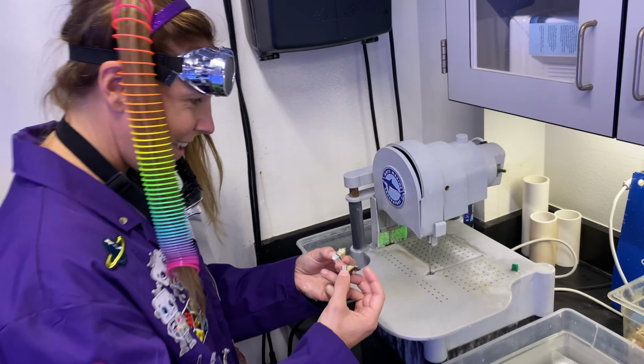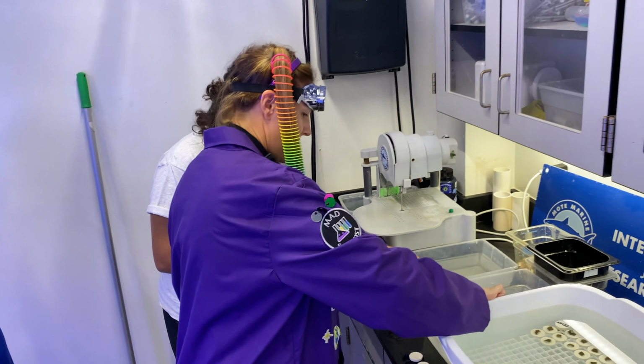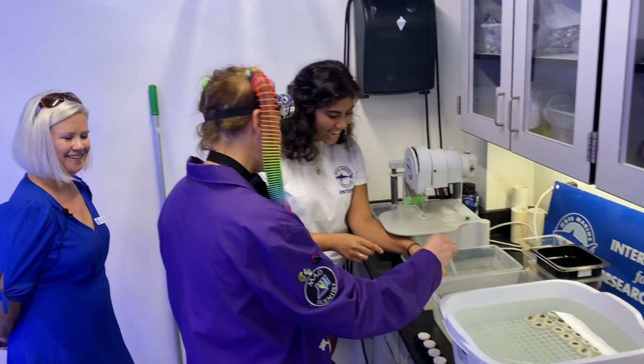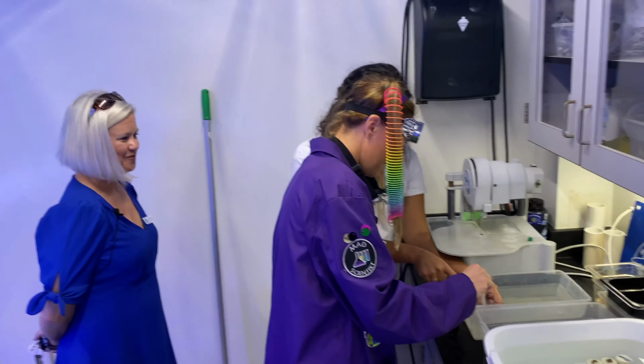Perfect. So if you want to give it a little rinse, yes. It's a great job. Great job, Professor Sko is a pro. Yes. Thanks. So do you want to give them a little pipetting? Just right on top of the tissue there.